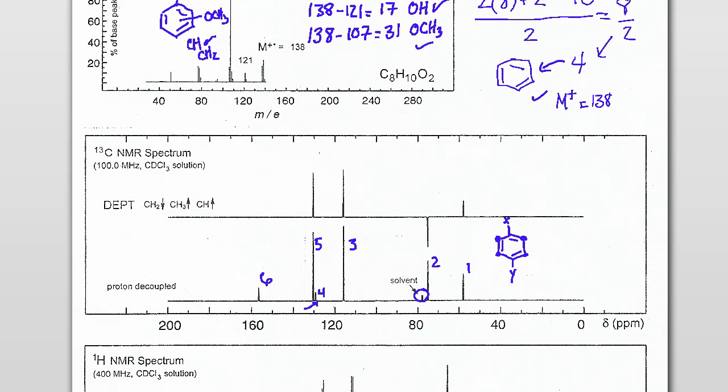So we then have most definitely a CH2 because of that inverted peak. Remember we were talking about an OCH3 group and then maybe a CH2 or a CH. It looks like we've got a confirmed CH2 group here. And this is most likely, okay, we're going to get further confirmation, but this is most likely going to be a CH3. All right, so this is shaping up.